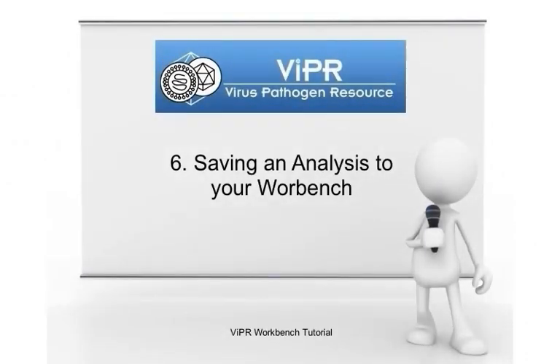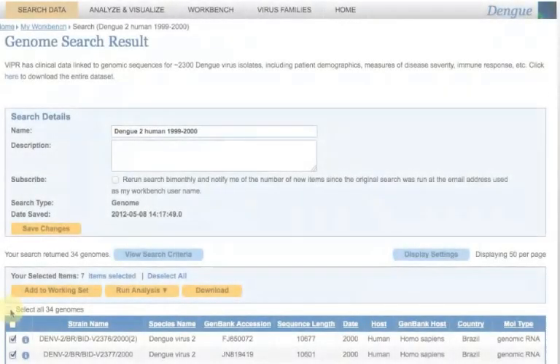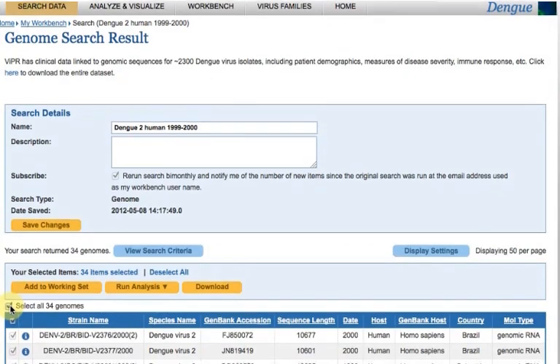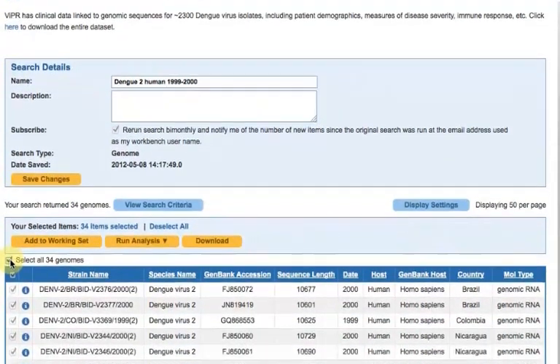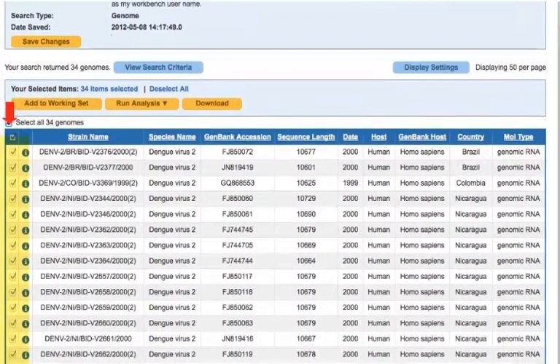Save an analysis to your workbench. On a search result page, you can select sequences and run various analyses on them.